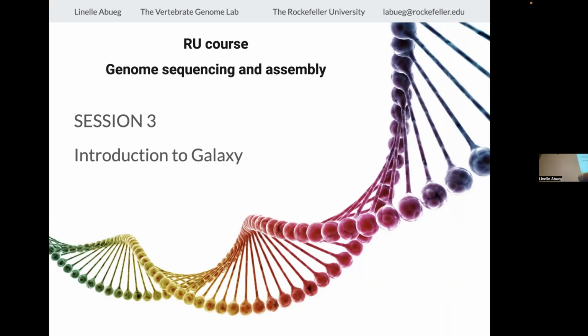But then with what you're mentioning, going around gives you a nice consensus. It will depend on the insert length. I will show later about 20 kb insert length, and you go around about 10, 12 times. So we will dive into this later.